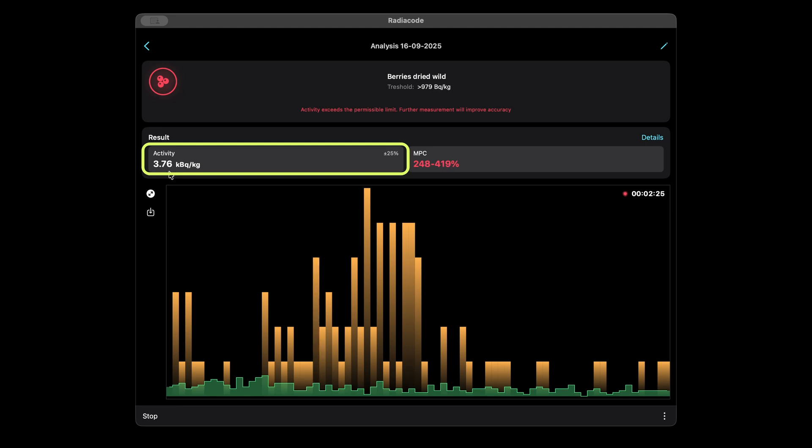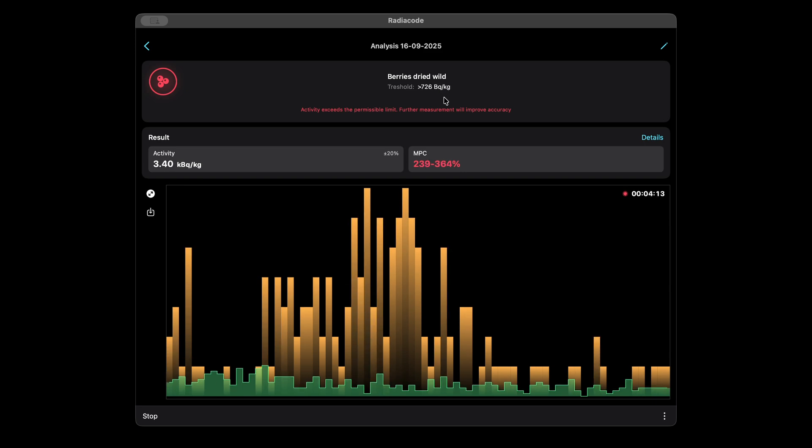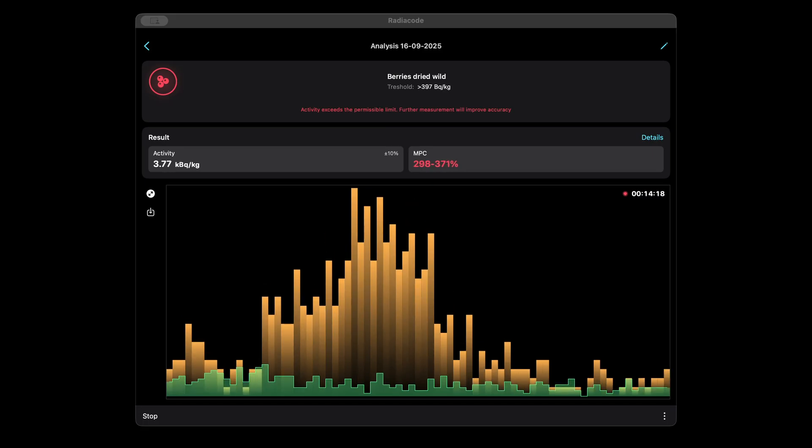Activity per kilogram is also shown, but MPC is the more reliable reference. Activity below 30 Bq per kilogram can generally be ignored — it's too low and often within statistical error. Threshold is the minimum detectable activity at the current moment; anything below it is invisible for now. As measurement continues, the threshold decreases and results become more precise. To reach the lowest possible threshold, use a high-quality background spectrum collected for 24 to 96 hours — the longer, the better.